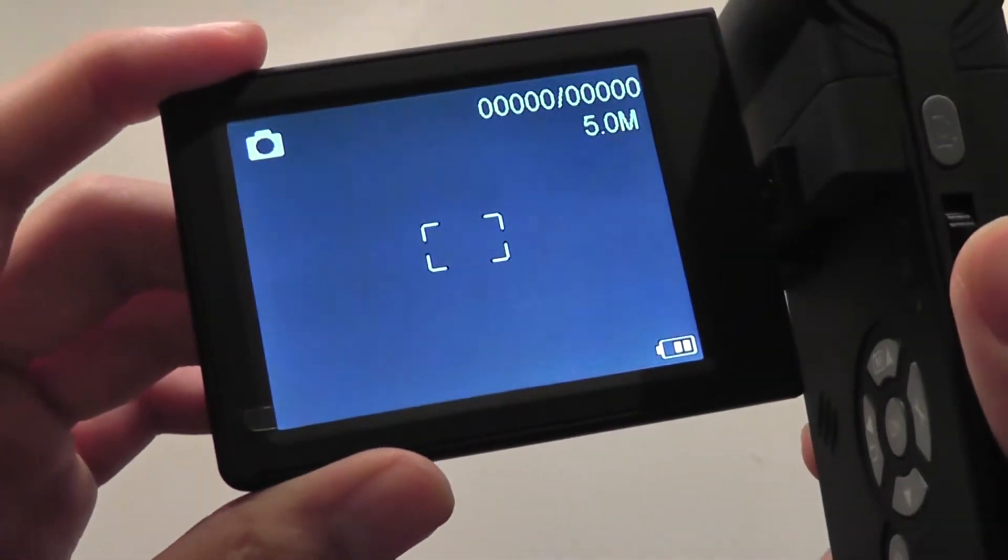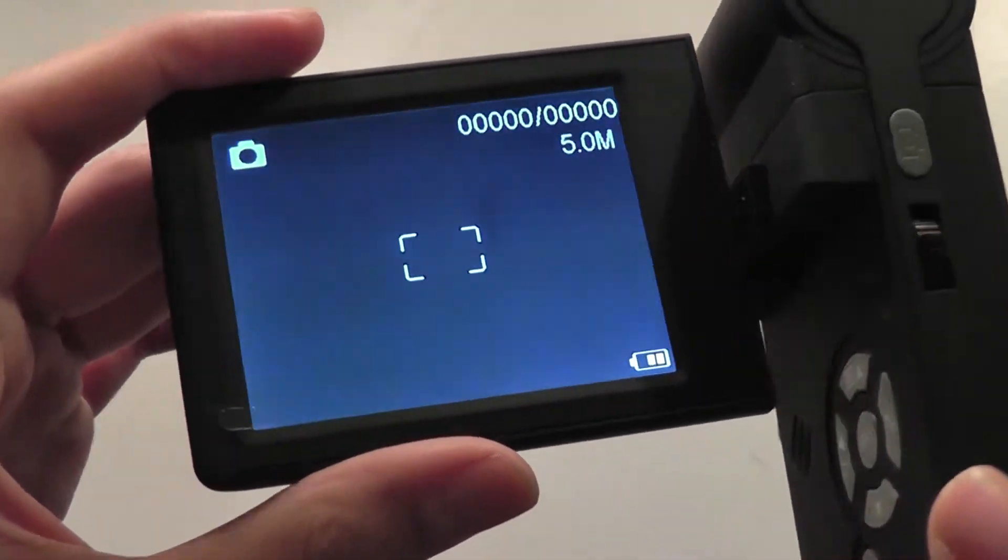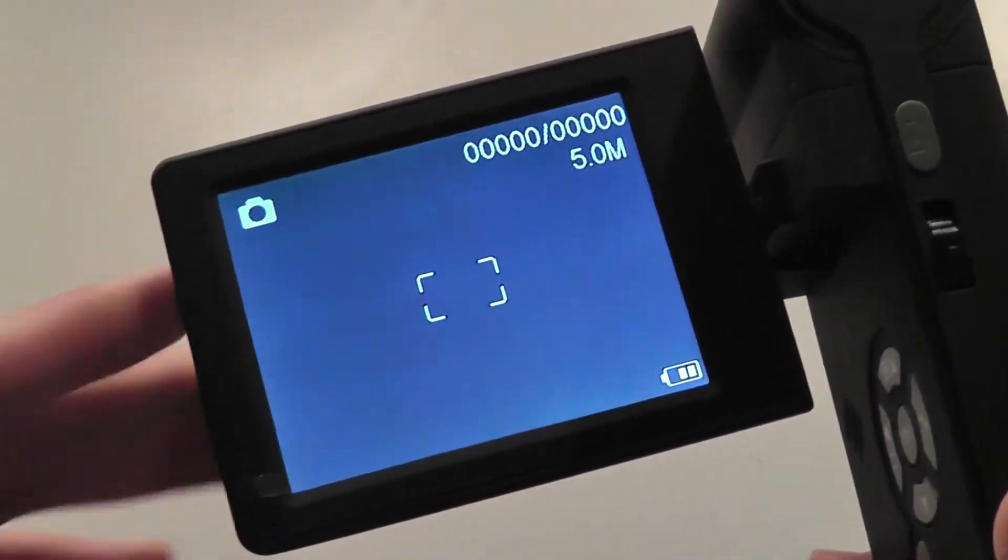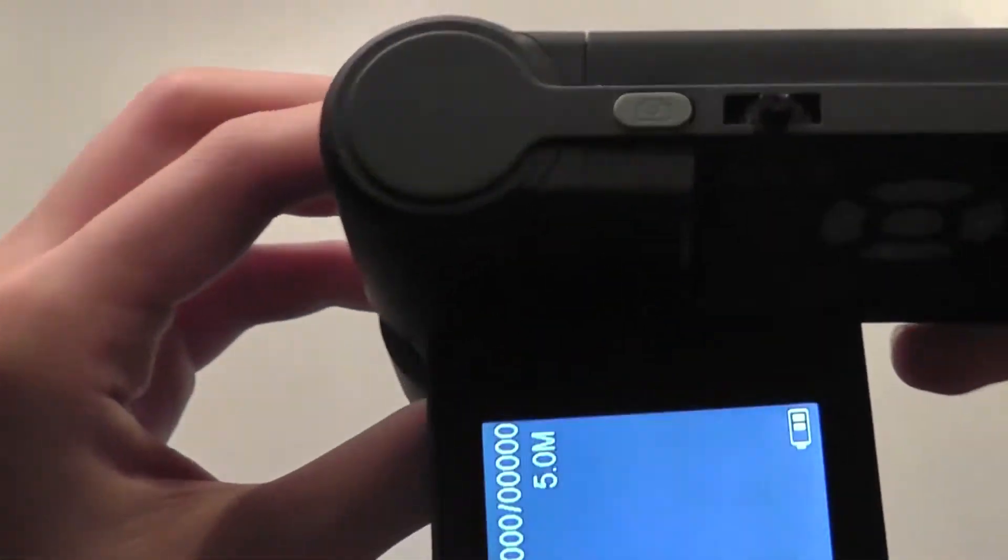We have a simple boot up screen that shows the welcome icon. You do need a full SD card inserted before you can actually use it. Battery life is pretty good. It lasted about two weeks or three weeks before we had to recharge it with daily usage, so it's pretty good as far as battery life is concerned.